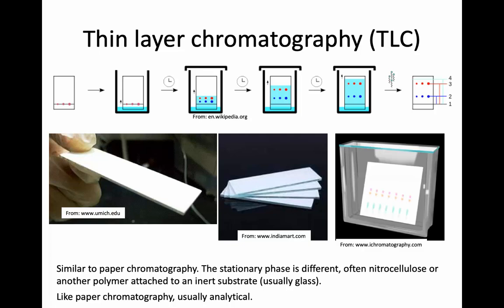in another example of planar chromatography, there is thin layer chromatography. Basically, the two things are interchangeable, same process, same idea, same use of the retention time as a parameter to associate affinity between an analyte and a certain stationary phase. The only difference is that in thin layer chromatography, people use different sorts of compounds. They can go from nitrocellulose to other polymers as their stationary phase.